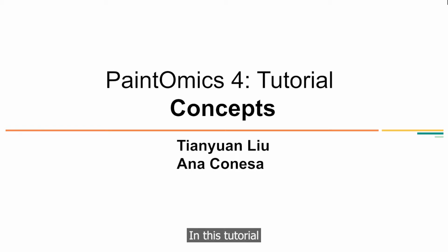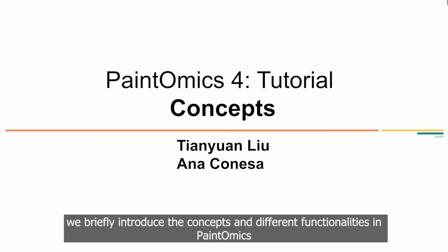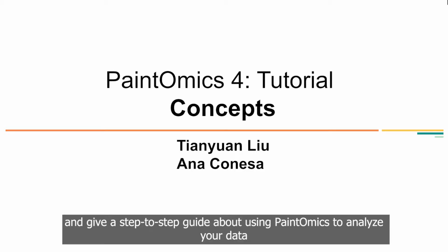In this tutorial, we briefly introduce the concepts and different functionalities in PaintOmics and give a step-by-step guide about using PaintOmics to analyze your data.